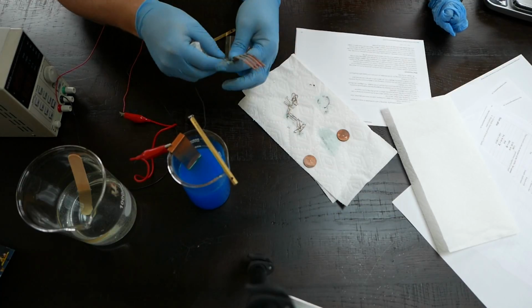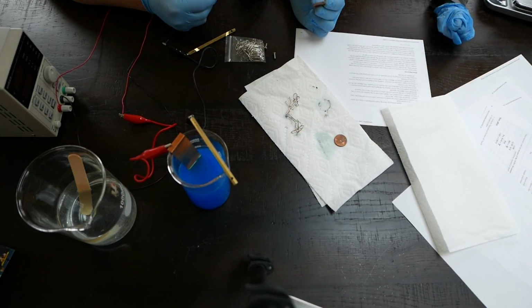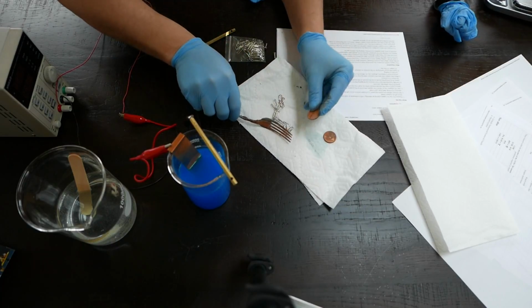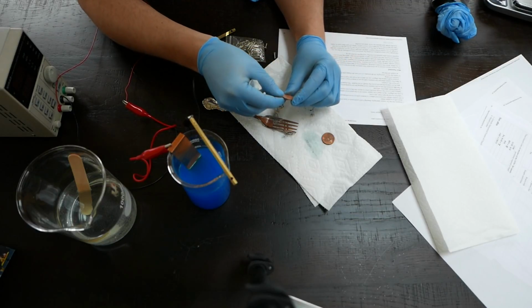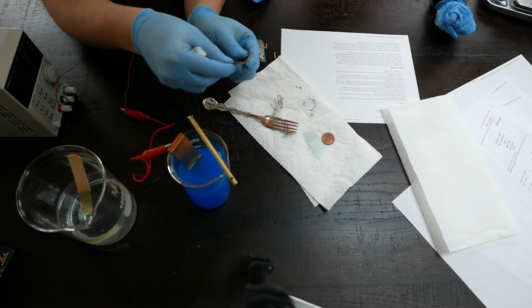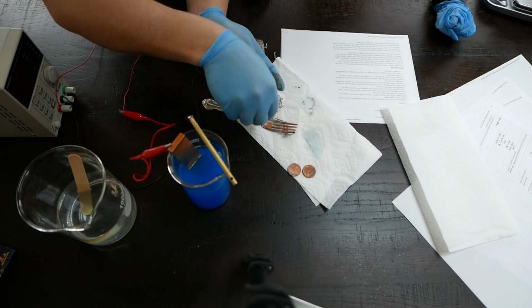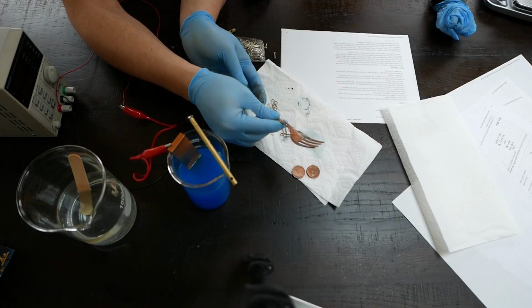All right, so here's what we got. We got a quarter. Does that look like it has copper on it now? Yeah. Is that pretty cool? We may put these back after we're done with the video. We might turn this back on and let them set for a little bit longer. But I think if we stop here and show what we got, this shows what was supposed to happen. We definitely got some plating going on.